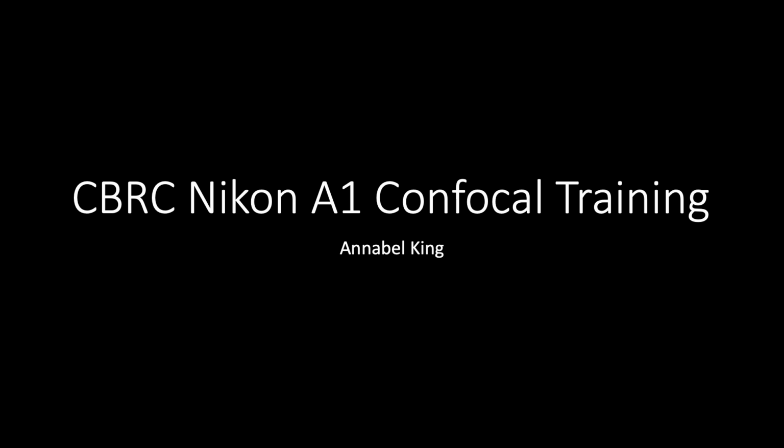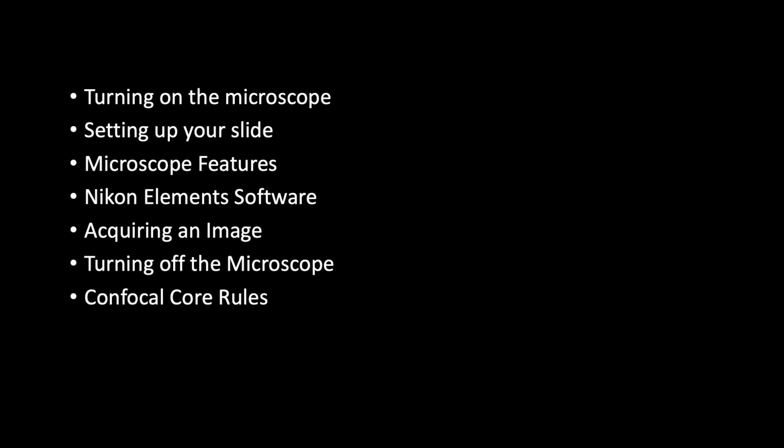Hi everyone, and welcome to the CBRC Nikon A1 Confocal training. In this, we will go over turning on the microscope, setting up your slide, the microscope features, the Nikon Elements software, acquiring an image, turning off the microscope, and rules we have for the confocal core in the department.